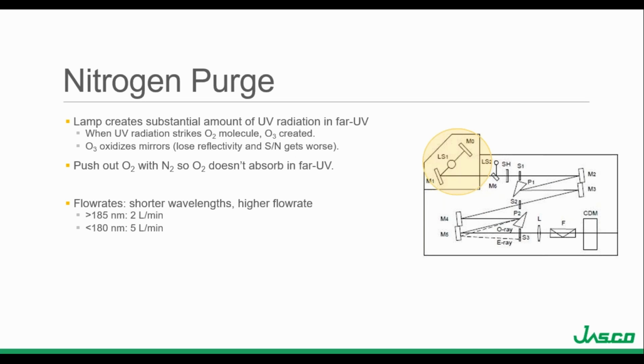Unfortunately, the CD instrument is not portable, and one of those reasons is because we need to purge the monochromator with nitrogen gas. So as is, the instrument sits and the monochromator is filled with oxygen. When you turn the instrument on in the morning, you want to purge all that oxygen in the monochromator with nitrogen gas. So we do this for 2 reasons.